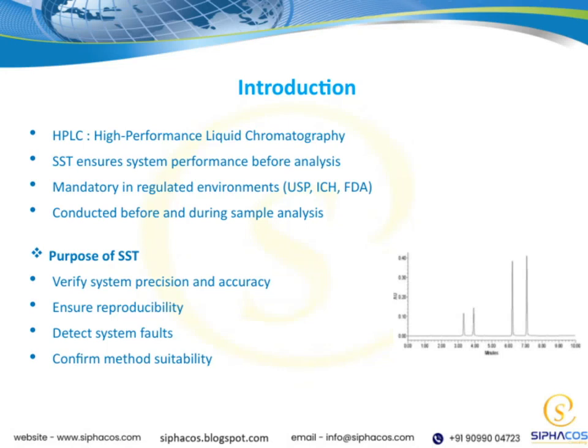Let's talk about the purpose of SST, or System Suitability Testing. Its main goal is to verify that our system is performing with the right level of precision and accuracy, ensuring that the results we get are reliable. It also helps us make sure that our system's performance is reproducible, meaning we can get consistent results across different runs. Additionally, SST is crucial for detecting any system faults early on, so we can address issues before they affect our analysis. It confirms that our chosen method is suitable for the task at hand, giving us confidence in our process.